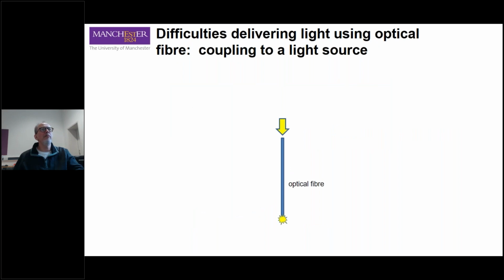Another problem may be coupling of the light source to the optical fiber. Coupling of collimated sources, such as lasers, to the fiber is usually relatively straightforward, but lasers are expensive and complex to work with. And after all, how many different lasers would you need in your lab if your chemical systems require many different wavelengths and the project requirements are changing with time? You can't change the lasers all the time.